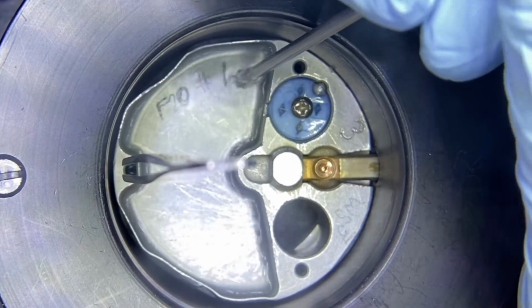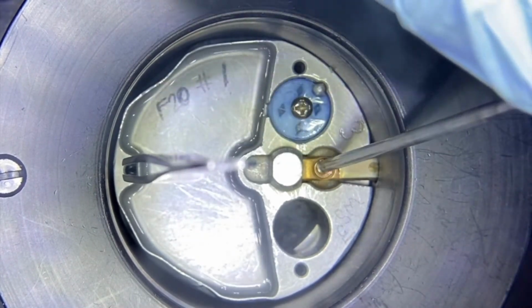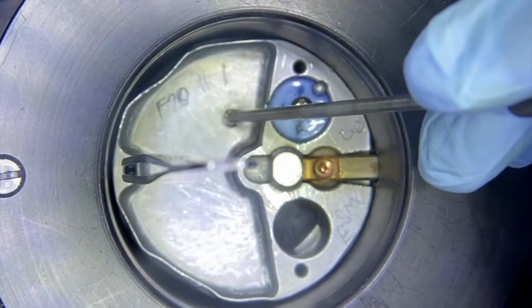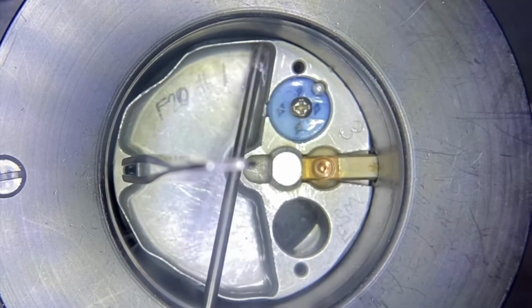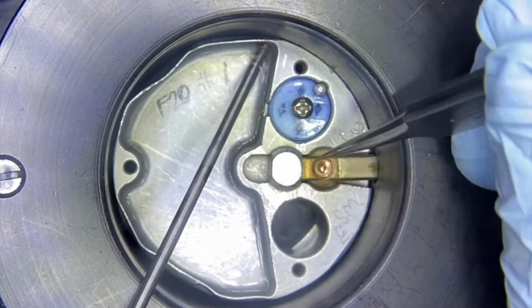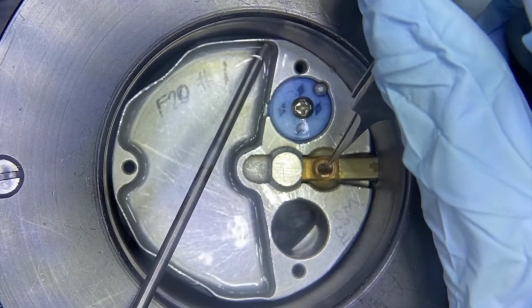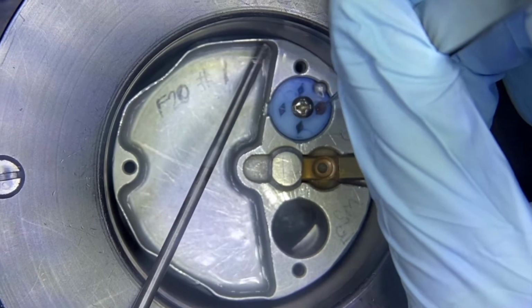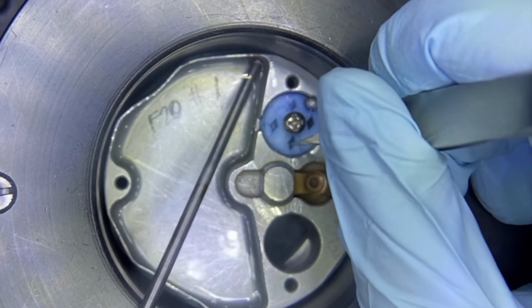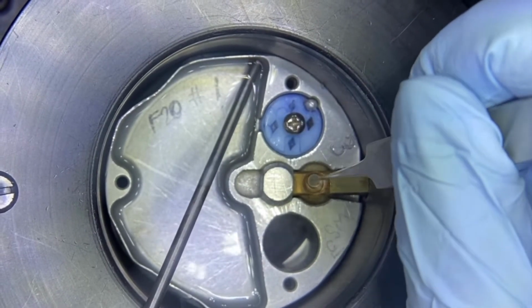Starting in the closed position, we will place it on top of the clip ring, twisting and opening the butterfly wings and lifting off the clip ring, keeping it in liquid nitrogen. Using the tweezers, let's remove our old grid. And let's load our new grid. Just gently place it over the center.